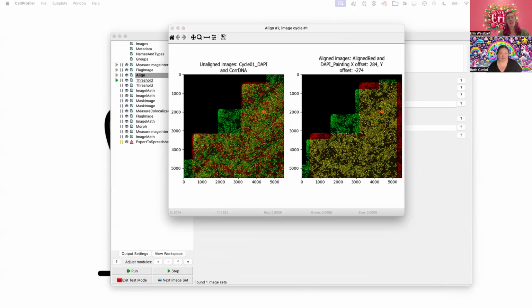And then after alignment, most of their overlapping area is now beautifully aligned, showing yellow with the green and red overlapping. But we have some signal on the side that is only coming from one channel, as one of the images was shifted to the left. And we have this stair step pattern where the stair steps are different along the edge. But now we have the signal itself how we want it to be.